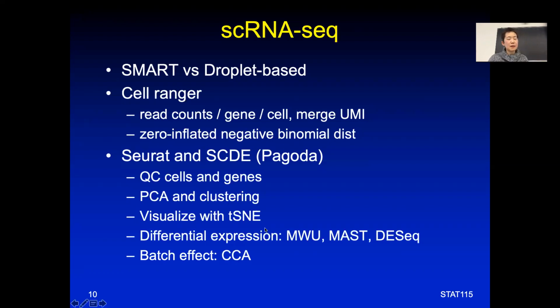And then we can visualize them on t-SNE, which again, within a cluster, you can see the separation, but the size of the cluster sometimes is not very good. If it's really tight, all the dots really overlay each other. The distance among the far away clusters is not representative. Okay, so it's not like if you see these 2 clusters versus these 2 clusters, these 2 are closer. That doesn't happen. But you at least can see distinct clusters better than what you will see from PCA. And then we can look at the differential expression.